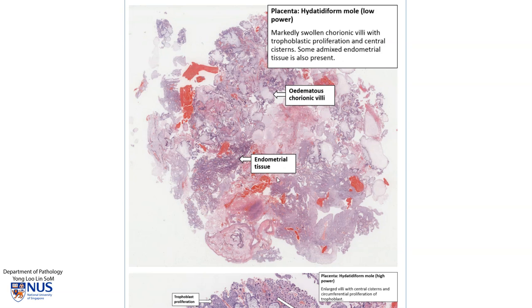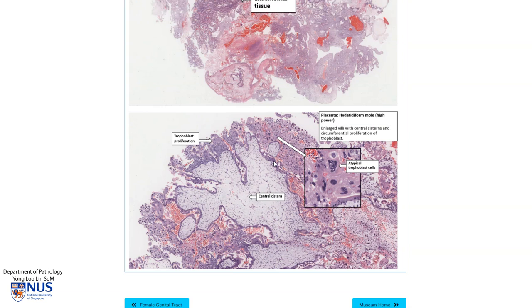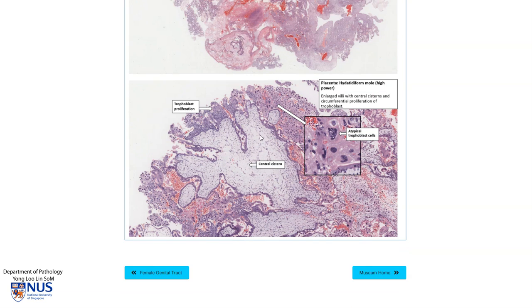There's also some endometrial tissue here, so this is taken from a curettage. Looking at high magnification, we can see a swollen villus. There are what we call central cisterns, which are empty spaces within the swollen chorionic villi. If we look at the periphery of the chorionic villus, we can see accompanying trophoblastic proliferation. When these villi become extremely swollen, they can be seen grossly as those grape-like vesicles.